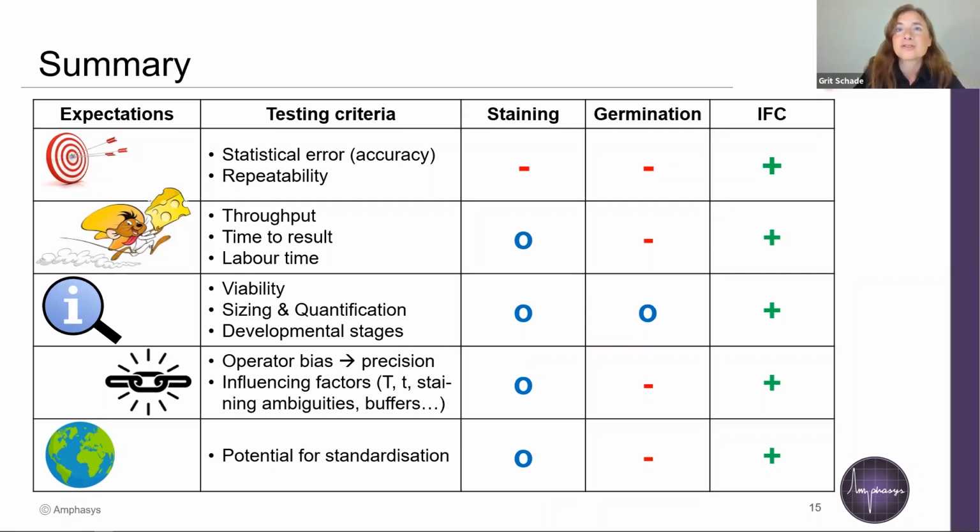There still come up a lot of questions about germination. One is, can we measure pollen vigor? Can we see the vigor by the pollen tube length? It's also visible with germination, the pollen tube length and the time how it germinates. Is it possible also to see this with impedance? Well, we have some indication, at least for many other cell types, not only for pollen, that the phase value can have a certain information, but to assign this information to a vigor, I would be quite critical or skeptical of that.